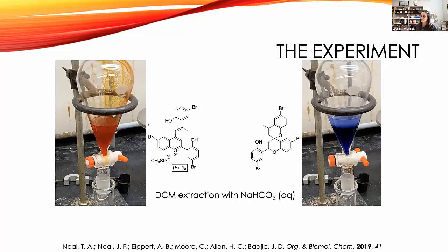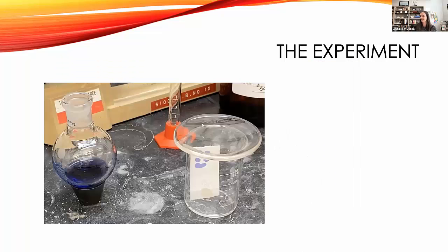So from the literature, these are a couple of suggested states of the molecule. And another added benefit of this lab is I get to ask students, what about these structures might be responsible for color, right? So bringing in a little bit about conjugation in different states, different ways that molecules can be arranged with the same atoms, and acid-base states as well. So this is really fun for them, and then they just continue with the fun.